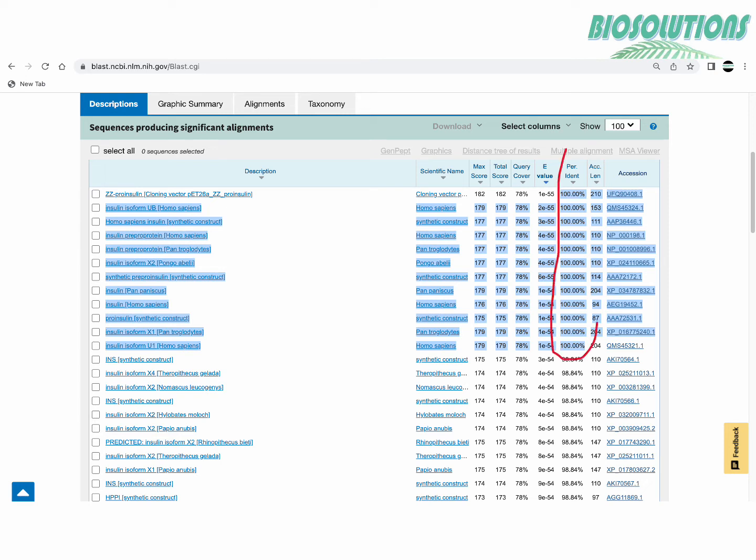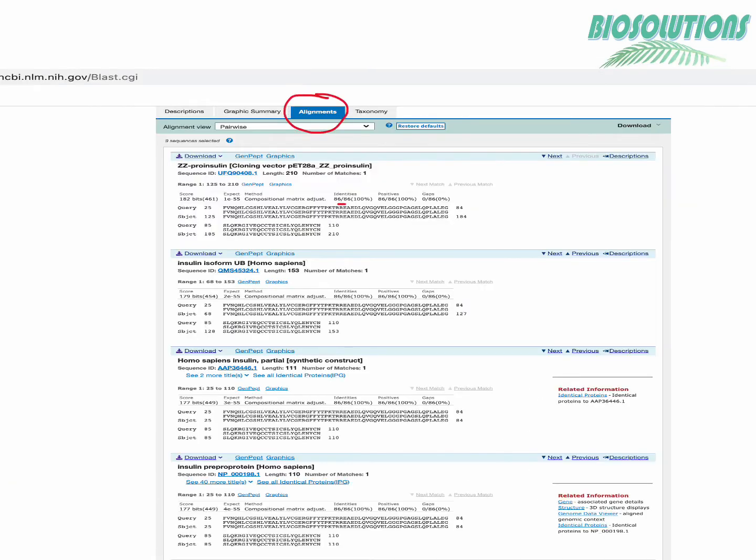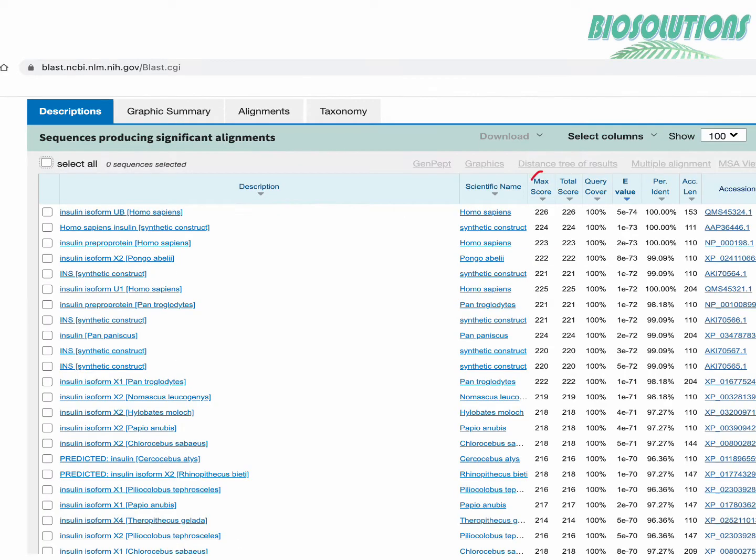For the first few results the percentage identity is 100%. That means there are no mismatches and gaps between the query sequence and the database or subject sequence as we call it. This can also be checked by choosing these sequences and by clicking on alignment tab. As you can see here they show a perfect match and a 100% identity.